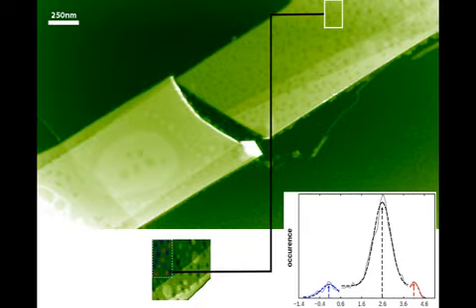To understand the two different height levels present in the rectangle, we plot the corresponding height distribution. The lowest peak found corresponds to water-free domains, surrounded by the first hydration layer.